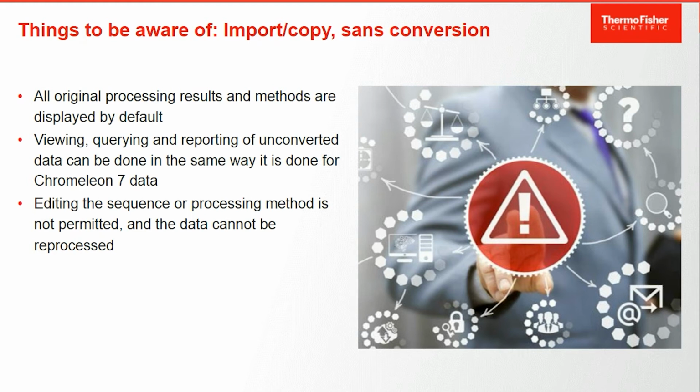And then finally, the one important thing to pay attention to is that you cannot edit the sequence or the processing method at all. So you can't reprocess the data. In order to do that, you have to convert the data, and we'll talk about that in the coming slides.